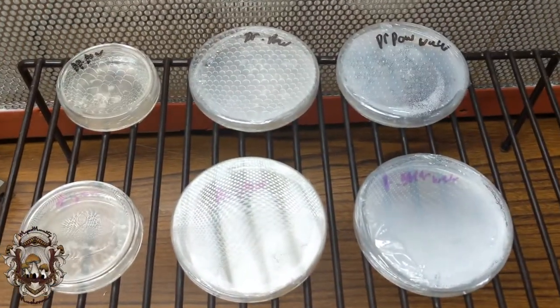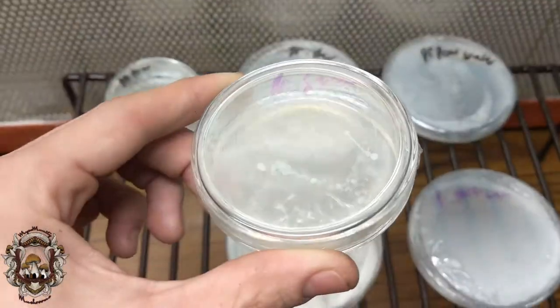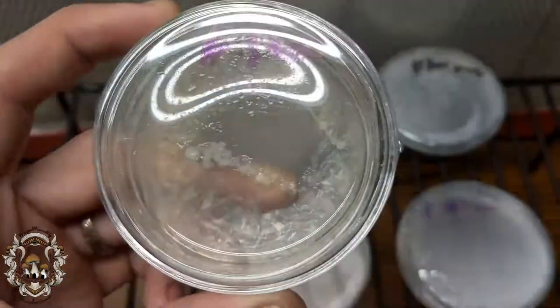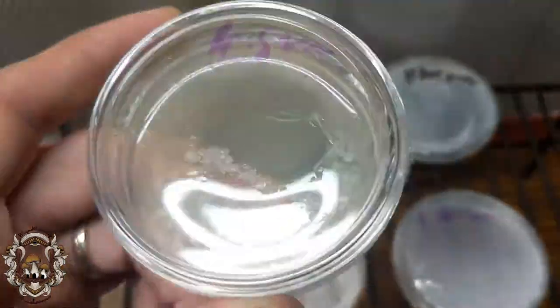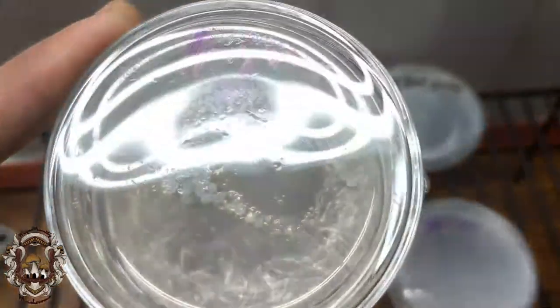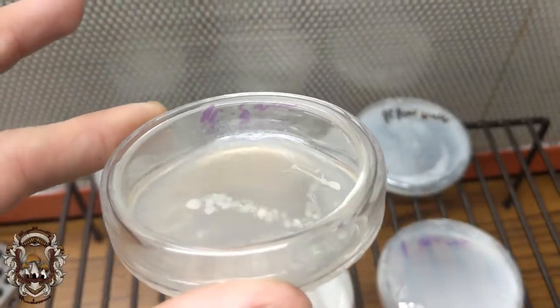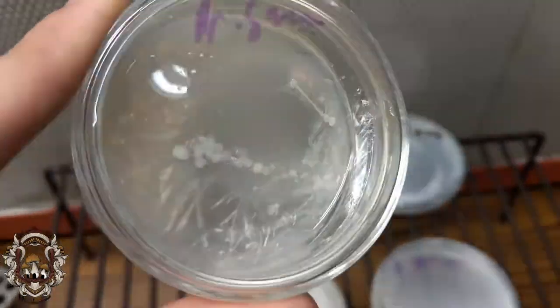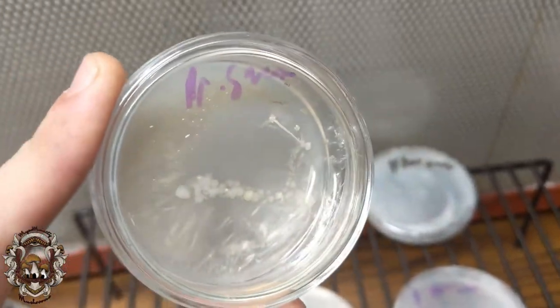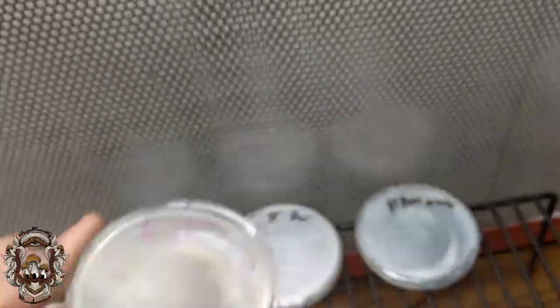It's been a few days and we're already seeing some growth, good growth in my opinion. Clearly bacteria and no mold, which is great. That's what I wanted to see. What else might be in here besides bacteria? How much care is going into this packaging process? Obviously, is it bacteria in the package since they have no ingredients labeled?